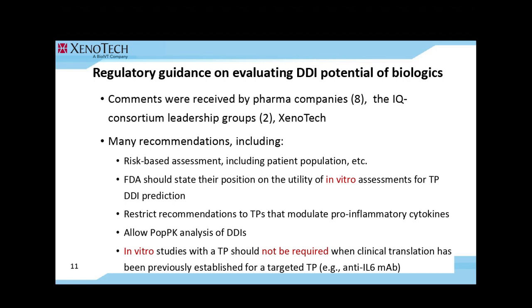Others suppress CYP levels indirectly by first causing the release of cytokines from Kupffer cells or peripheral blood mononuclear cells. Examples of those are endotoxin, which we use as a positive control in our assay, and synthetic and bacterial oligos that contain pathogen-associated molecular patterns, such as CpG motifs.